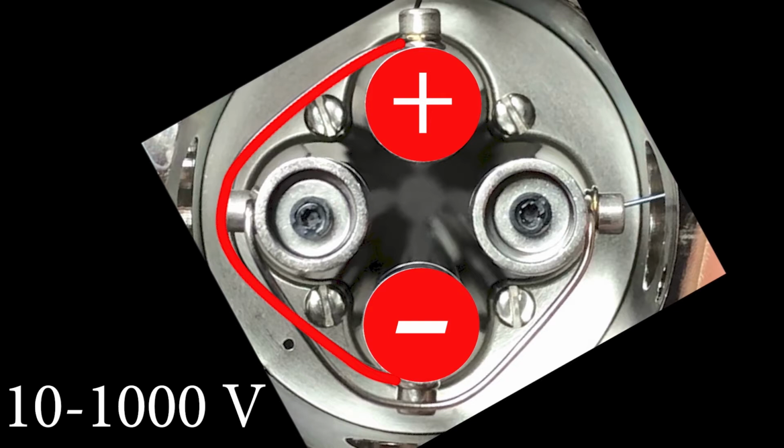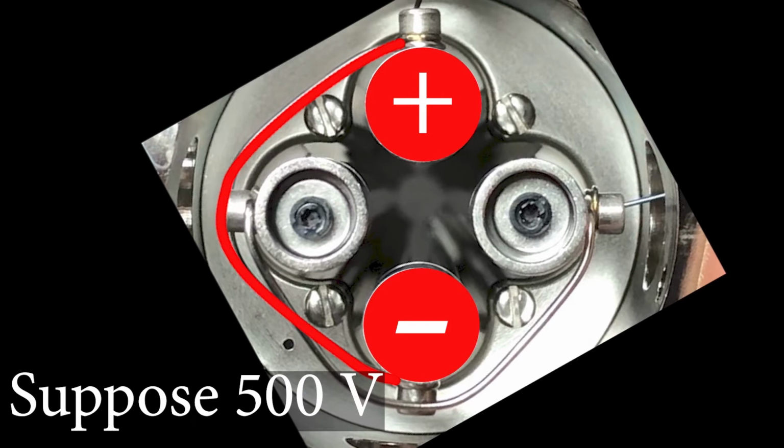The voltage difference for a quadrupole mass filter is typically going to be 10 to 1,000 volts, but let's suppose that we are putting 500 volts between this pair of rods here. When we've been talking about voltage, we've really been talking about what's called DC voltage, or direct current. What that means is, if we're applying 500 volts DC, then we turn on the 500 volts, one of the poles is at 0 and the other one's at 500 volts, and it stays at 500 volts. If we turn on the power supply and turn it up to 500 volts and leave it for a while, it stays at 500 volts the whole time.